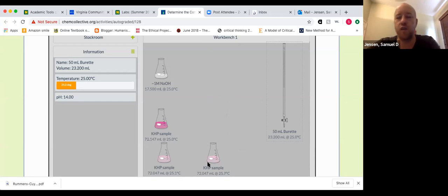Average the values, or calculate the KHP's concentration, or the moles of KHP in your 3 samples, which theoretically at this point would all be the same moles because you only used 1 sample and we just duplicated it. So my volume titrated would then give me an average value of sodium hydroxide, which again theoretically should be the same number for your 3 trials, presumably.